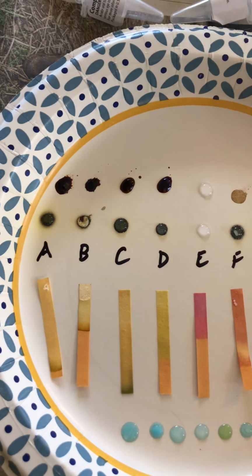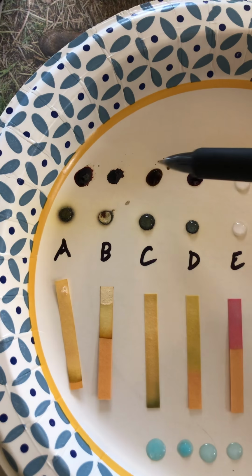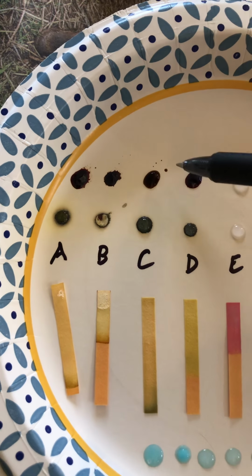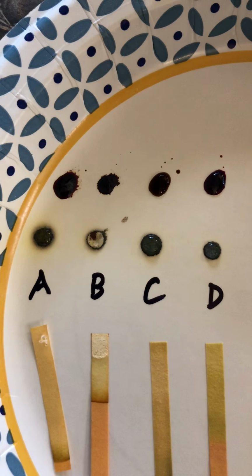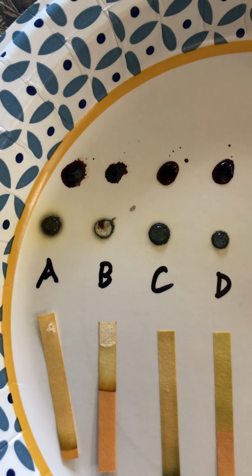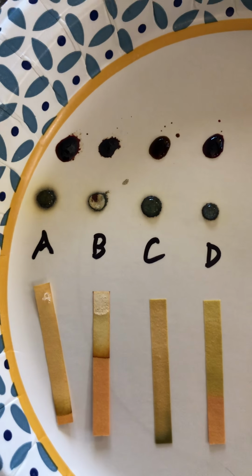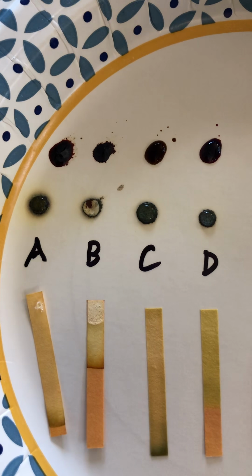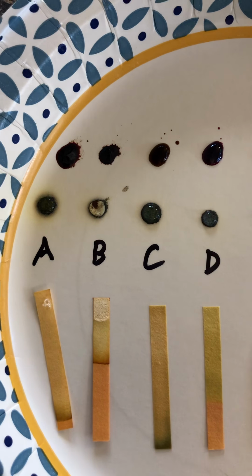Okay, out of all the basic compounds, only one oxidated, which was C here. And it's tough to tell, but we kind of spread out the dot a little bit, and this one turned kind of brown, so I know that it oxidated rather well. For that one, I chose xylitol, because xylitol's got a bunch of alcohols, which should have oxidated with the potassium permanganate rather well.